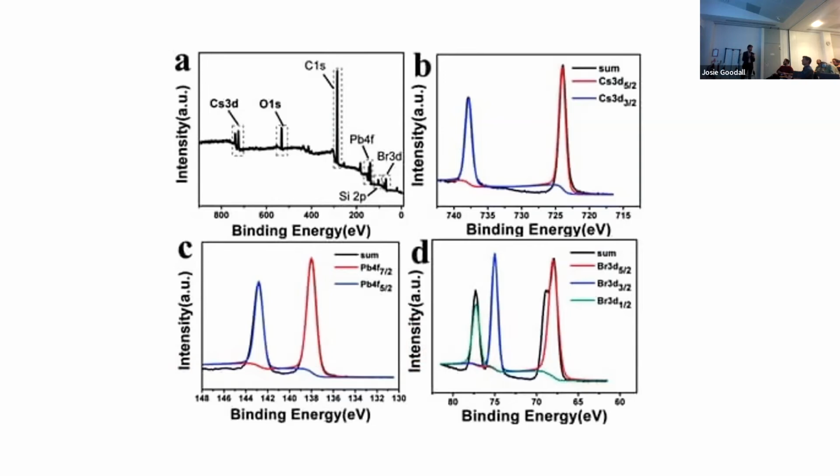Background is one. Yeah. Anything else? There's a broken bromine 3D 1/2 there. Yeah. So they invented new quantum physics. High impact labels. But yeah, maybe not for the best reason in this case.